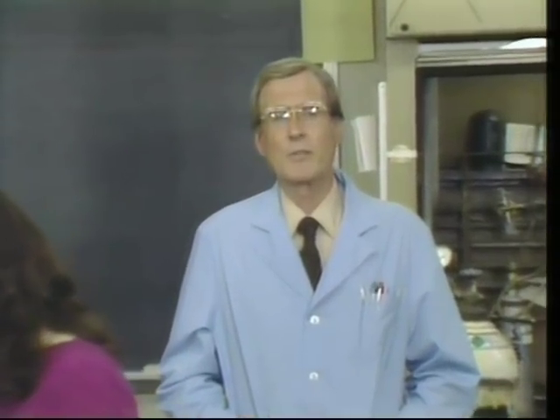Your lab instructor is trained in safety procedures and first aid, but the ultimate responsibility for your safety is your own. After all, who can look after you better than yourself? In order to practice safety, you need to develop a safety consciousness, and this program is designed to help you begin to develop this way of thinking. Now, we'll focus on what you can do to act in a safe and responsible manner.